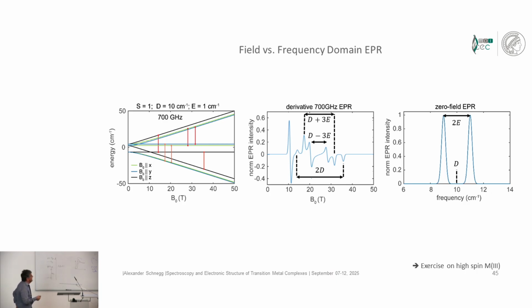The problem in this case is rather the field. I don't know if you know about the availability of external magnetic fields, but even at high magnetic field facilities like in Tallahassee or in Dresden, 30 is pretty much the edge. And therefore, for these cases, it may be fortunate to sweep not along the field axis. If you cannot sweep far enough, for example, in this case of 100 reciprocal centimeters, it's hopeless. The spectrum would be here somewhere.